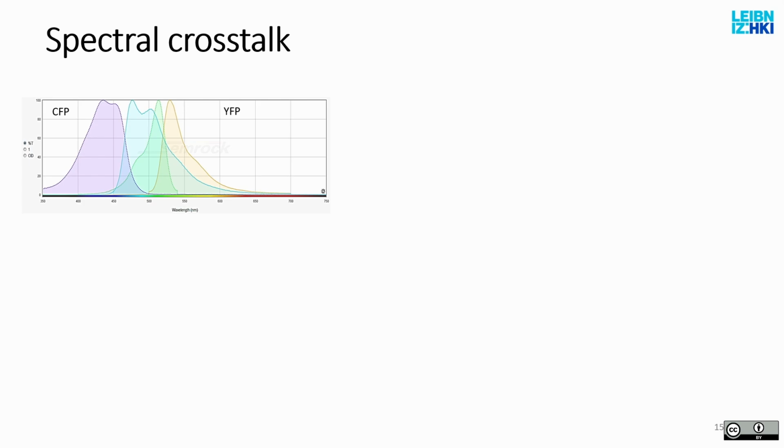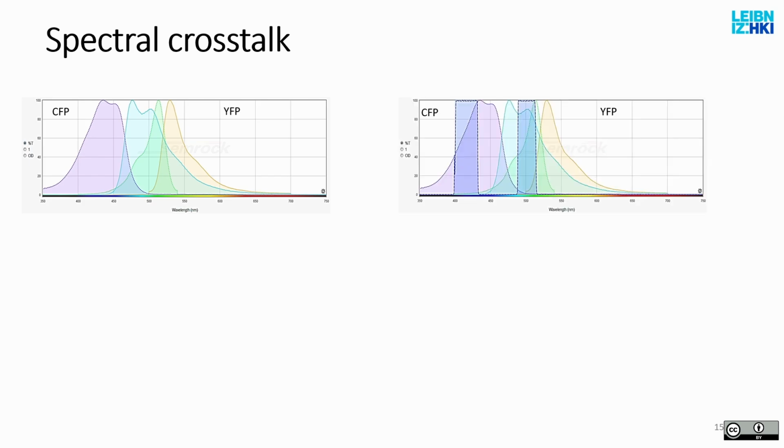And we discussed this live during the lecture, the homework period yesterday, that if I just tell you, okay, the excitation peaks are at 420, 488, and 510, for example, or 530, 550, based on that, you can estimate your excitation needs, what lasers you will need, for example, but you will not be able to design your filters. You will need to know what the spectrum looks like for each of these labels, how wide they are. And the reason is that eventually they start to overlap.